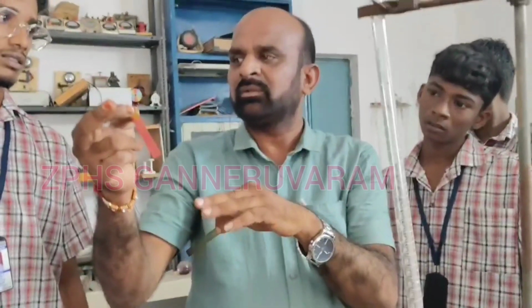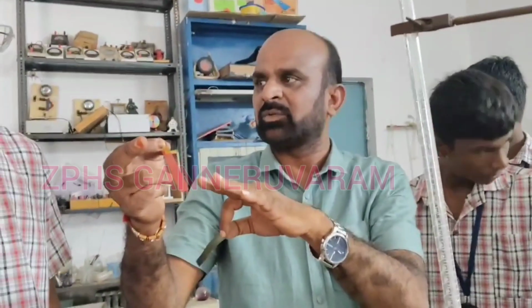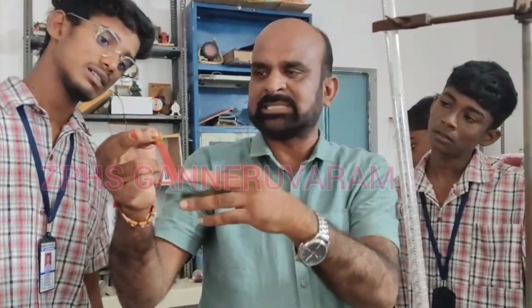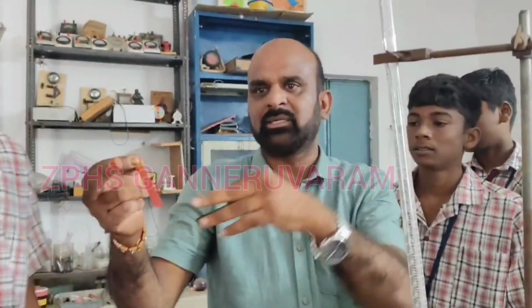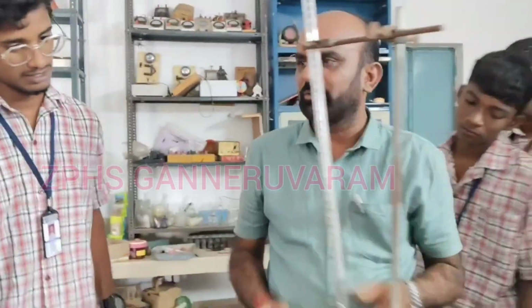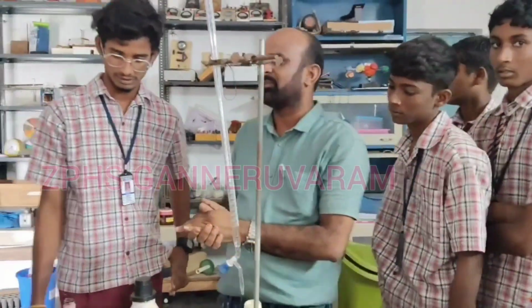The red color we get for what solution, acid or base? Acid. And blue color for what? Base. Okay, this is over. Very good. You got good knowledge from doing this experiment.